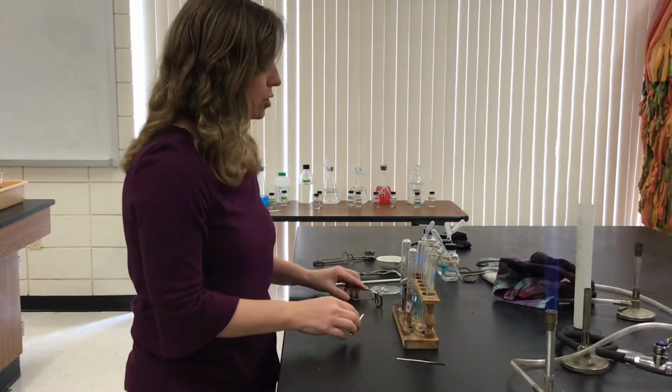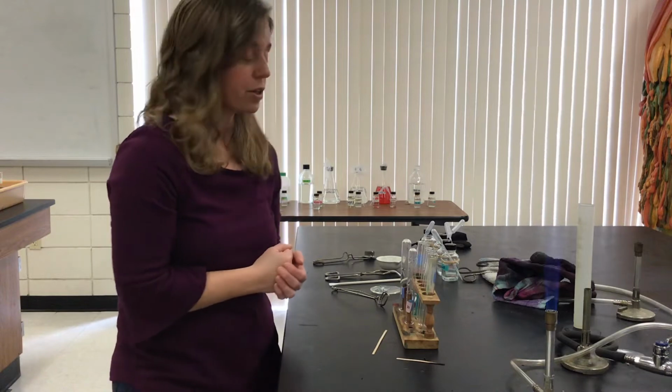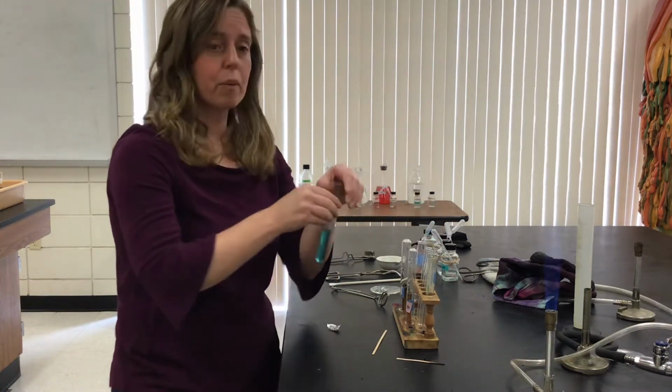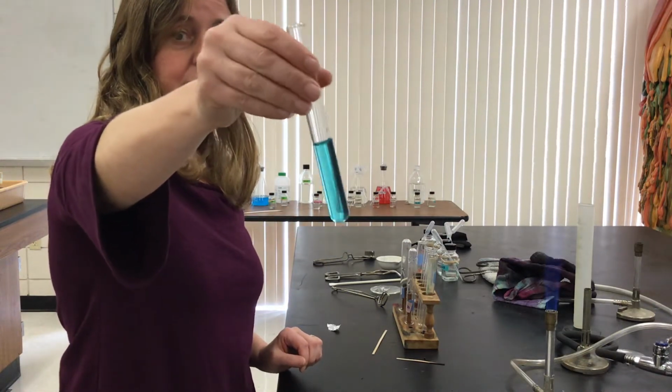Now we're going to move into a single replacement. We're going to do two single replacement reactions. The first one we're going to do is one with copper chloride. So I went ahead and measured out, and you can see what it looks like. That's 10 milliliters of copper chloride.